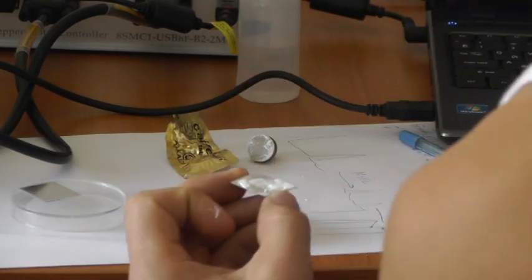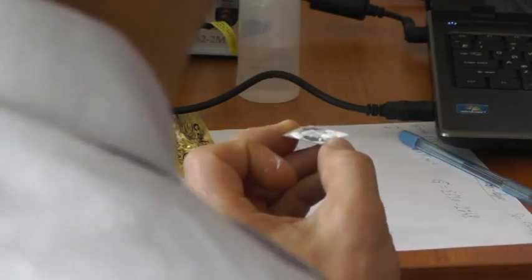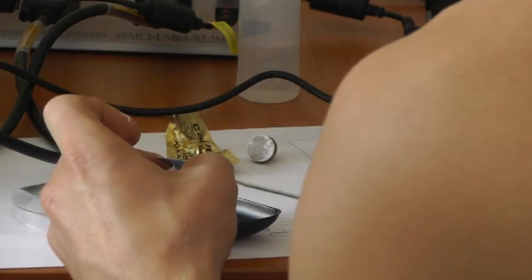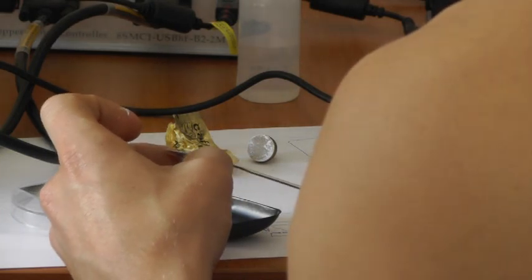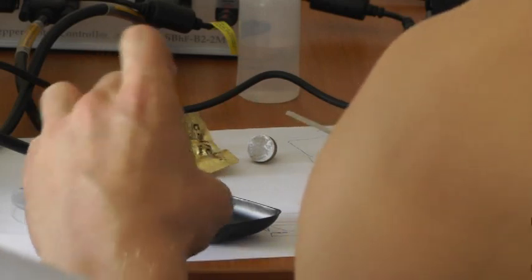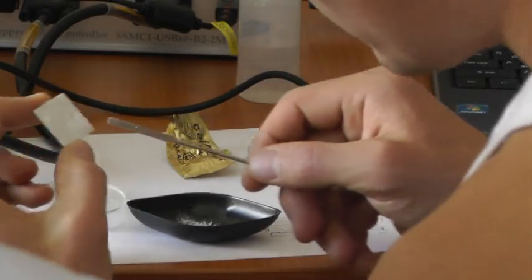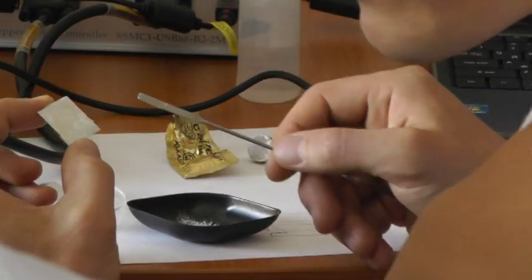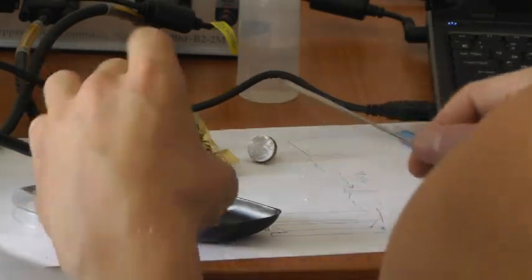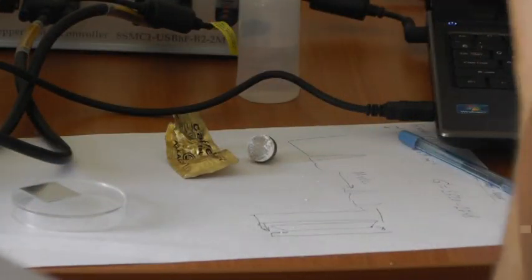Have something on the surface. In principle, even just a trace amount of powder particles is enough for recognizing. Like this, you see the surface is not covered completely. There are just some microparticles, and we put it under the objective.